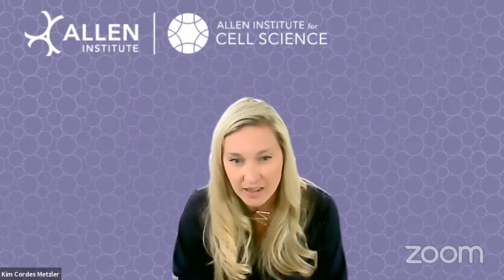Caitlin, did you want to add anything to that? Yeah, no, that's great. Like you said, we're an imaging-based institute, so our approach was imaging-based. That's one of the reasons we naturally gravitated towards RNA FISH, so that we can integrate that structural information.